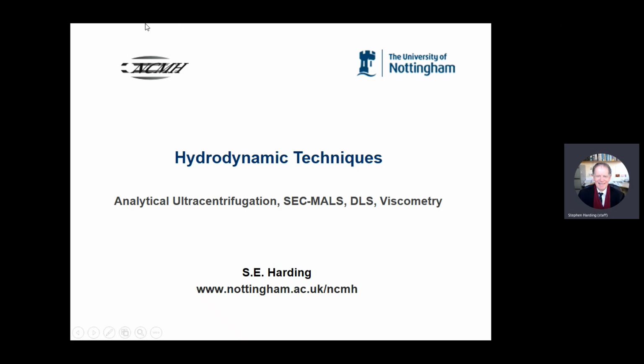Okay, so this is going to be a little review on hydrodynamic methods. These are methods for looking at molecules in solution. So it completes the solution loop, if you like, in terms of what we've been talking about with the properties of molecules, including molecular weights and conformations you've just been talking about. But four techniques: the analytical ultracentrifuge, SEC-MALS, dynamic light scattering, that's what DLS stands for, and viscometry.